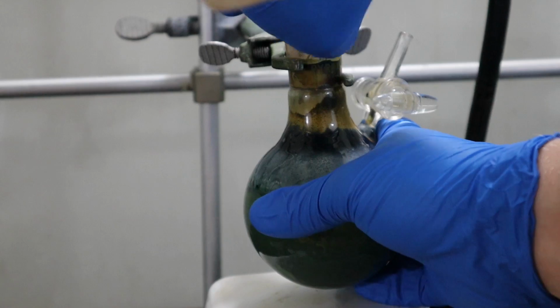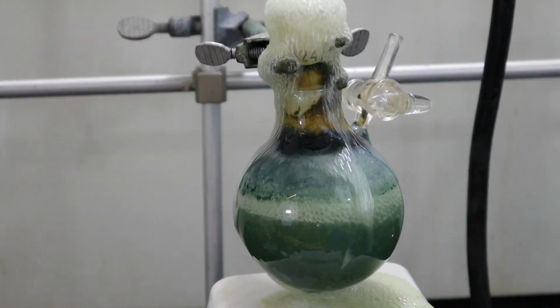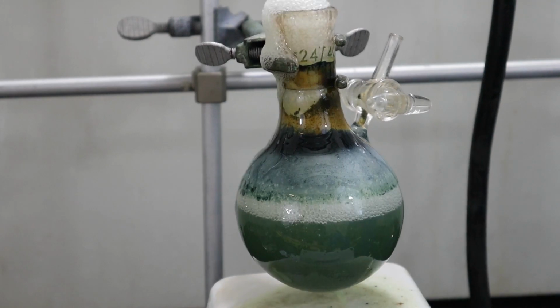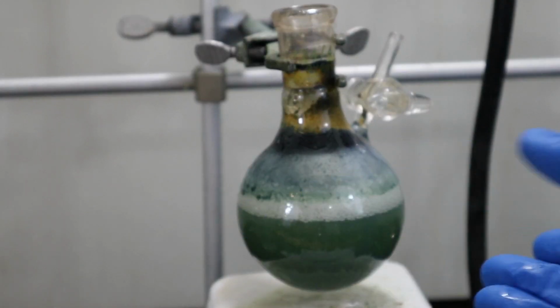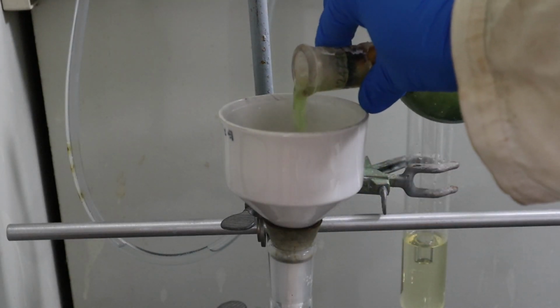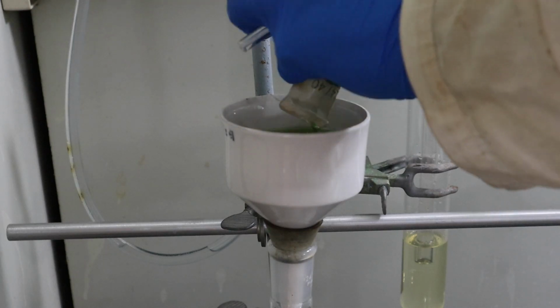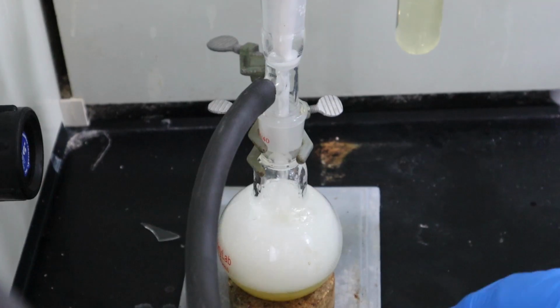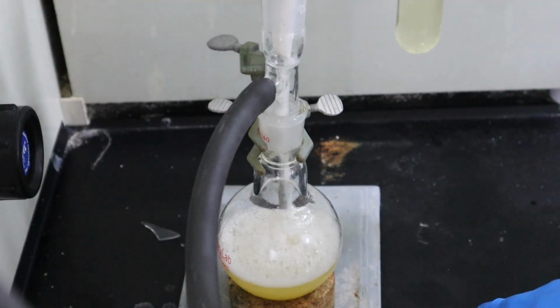The next morning, when I removed the septum, the contents of the reaction bubbled over like a soda. I think the methylamine suddenly came out of solution when I relieved whatever pressure was inside the flask. I filtered the contents of the flask to remove titanium dioxide, but some still got through. The remaining toluene was removed with the rotovap, producing 12.5 grams of pale yellow solid. This represents a yield of 88%, identical to the yield presented in literature.